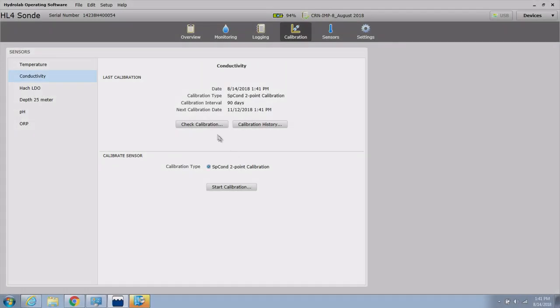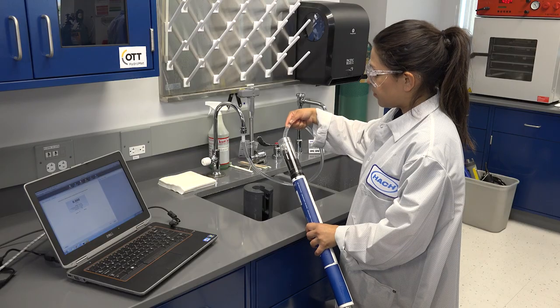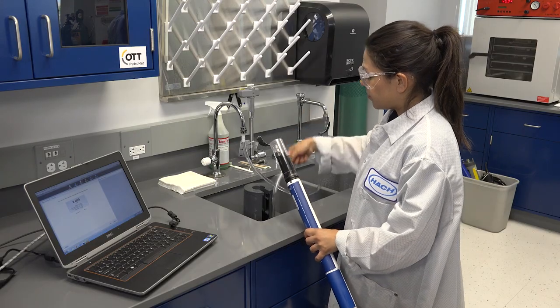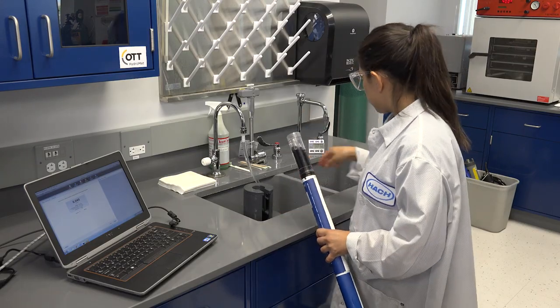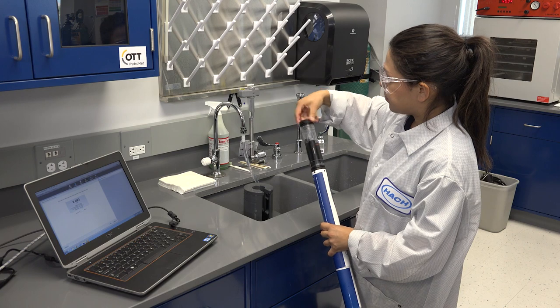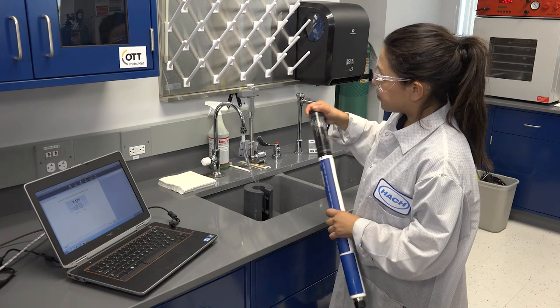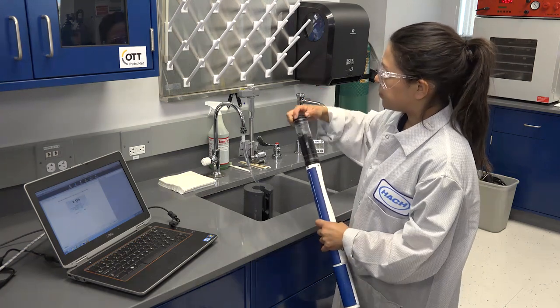Calibration check: After calibration, it is recommended to perform a calibration check to verify that the sensor slope is correct. You can access the calibration check in the Calibration tab of the HydroLab operating software. Follow the instructions on the right side of the screen.